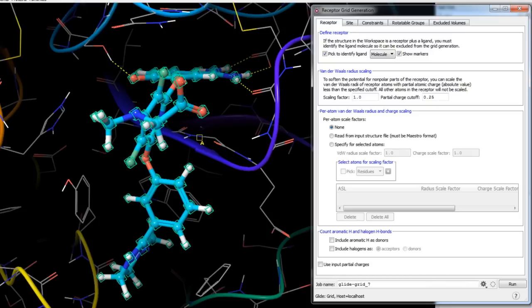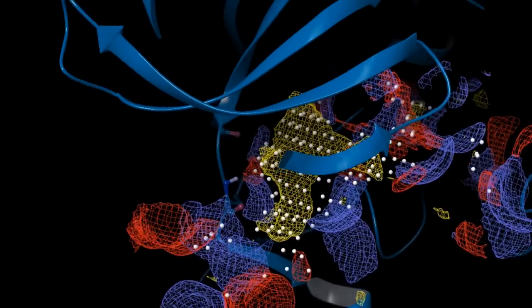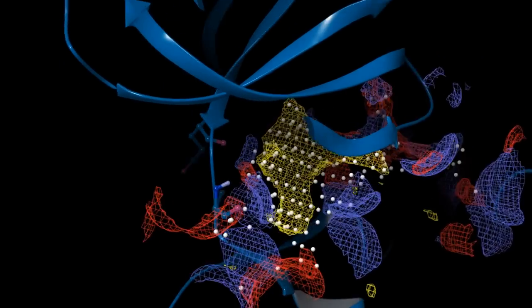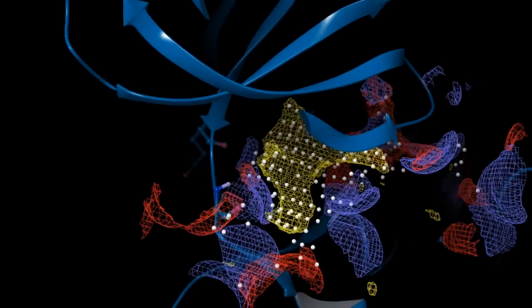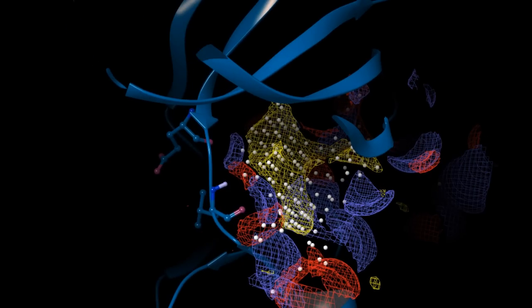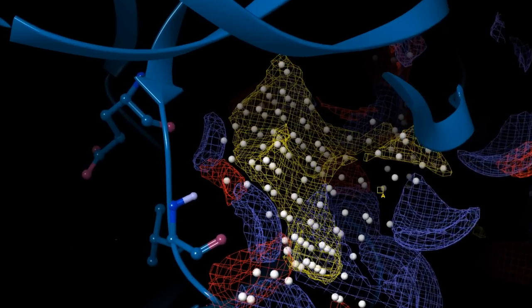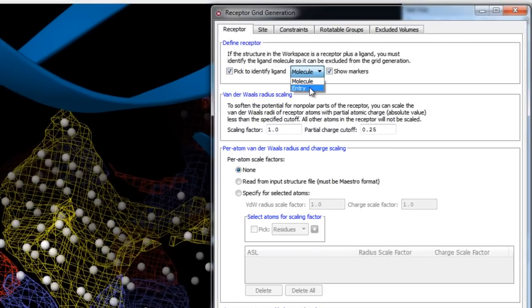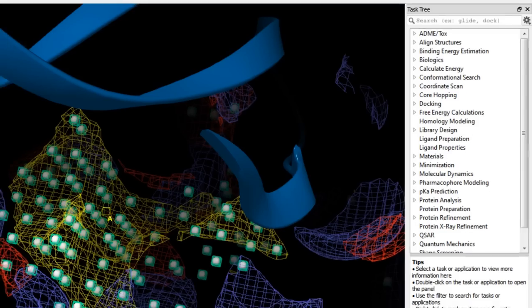Everything not defined as the ligand will be treated as part of the receptor, and this may include any ions, waters, or cofactors. If you are using a binding site from a SiteMap calculation — for example, to identify allosteric binding sites — switch the selection from Molecule to Entry and then pick any of the SiteMap points.